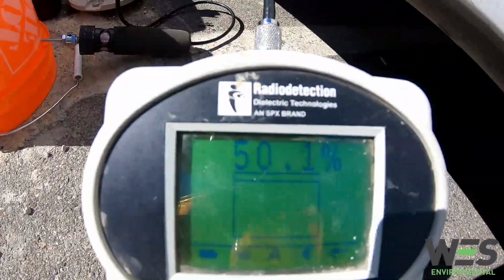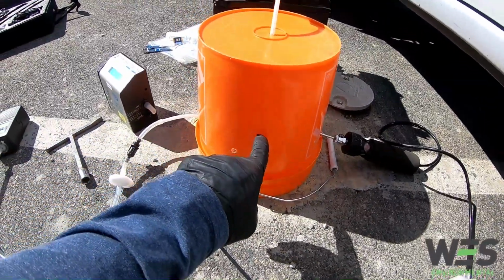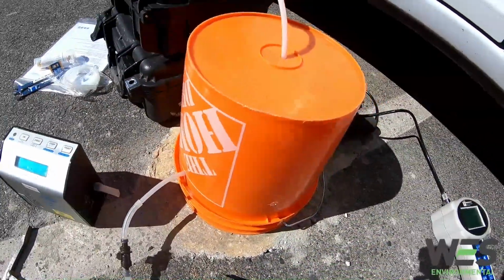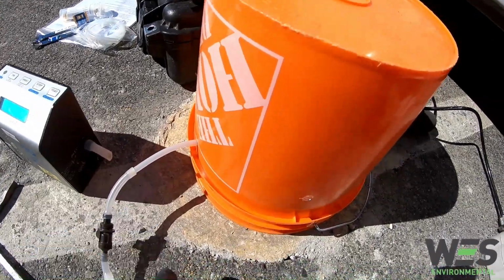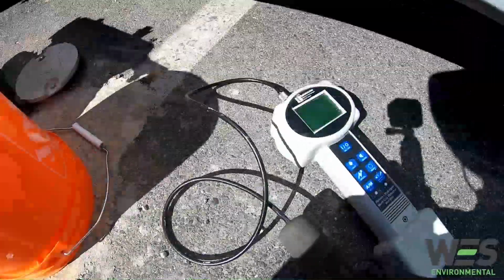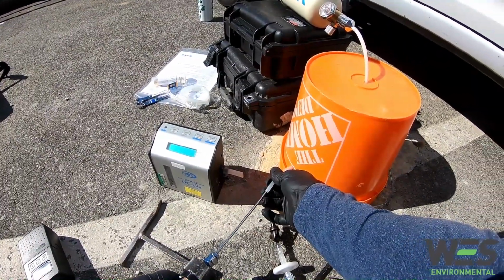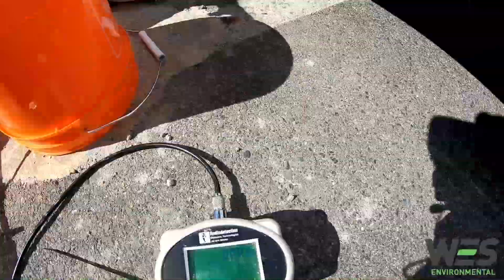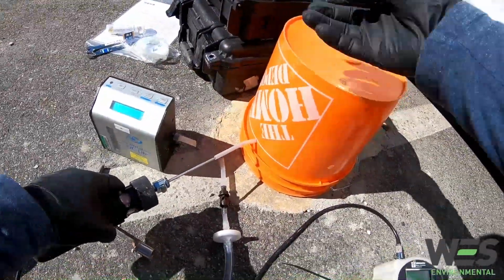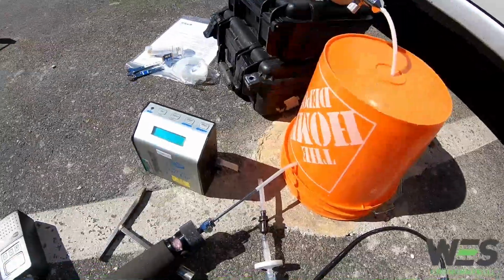We just got to 50%. So that means that at least half of the volume in this shroud, aka bucket, is helium. So if there are any cracks or leaks anywhere, it's going to get into the line and we'll be able to detect it. So I'm going to pull the detector out and I'm going to let it zero. It's going to take just a little bit. Put it all the way in the tubing. Take a look. Yeah, so that's good. No jumps at all, no leaks. So we can shut the helium off. We can shut this guy off. And we can start sampling.